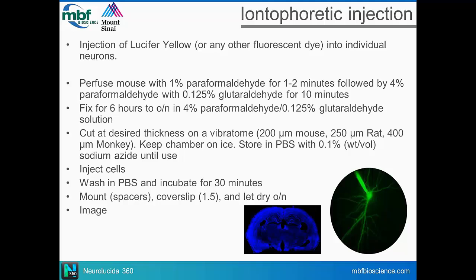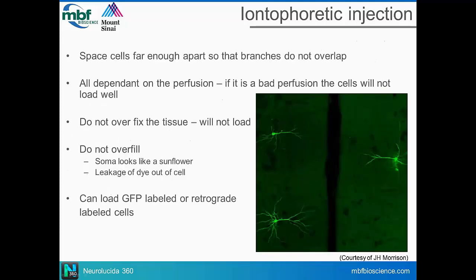So it's really important to use the proper cover slip. To go back to the cell loading on the next slide, what's important in this technique is that you evenly space your cells far enough apart.